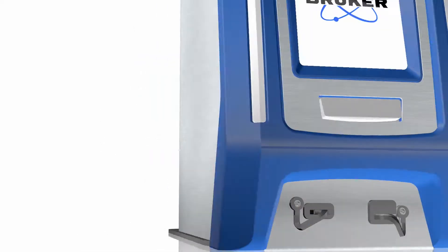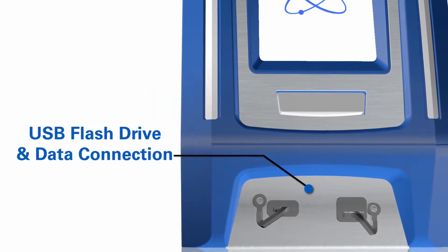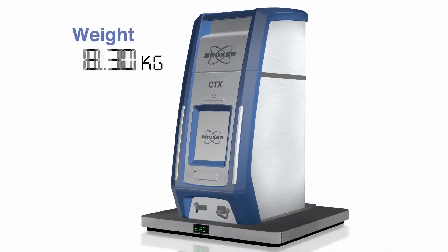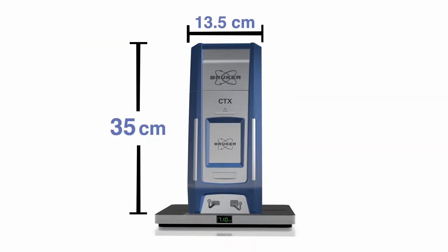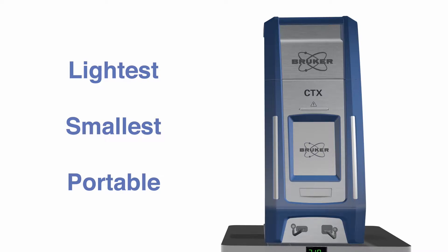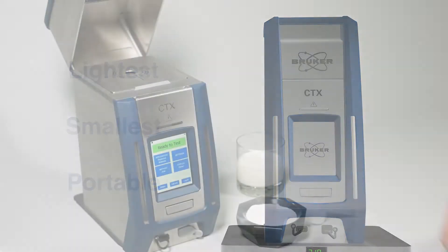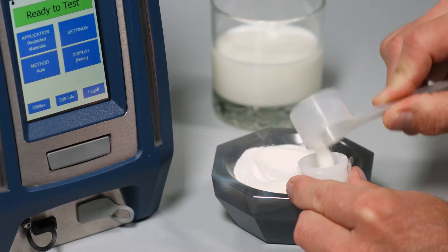The battery, AC connection, and power switch are located at the back of the unit, while the USB connection for flash drive or data connection is conveniently located at the front. At less than 7.1 kilograms in weight and 35 centimeters in height, the new CTX is the lightest and smallest double safety-interlocked portable XRF available.